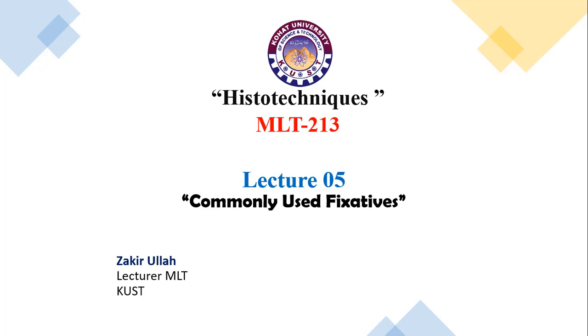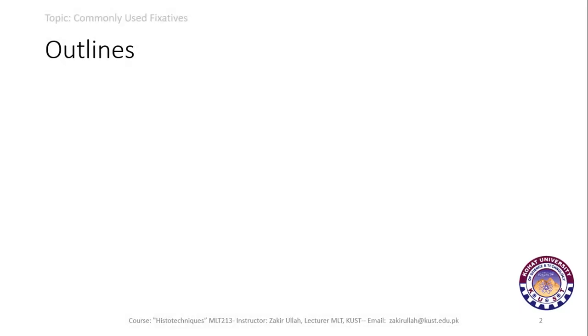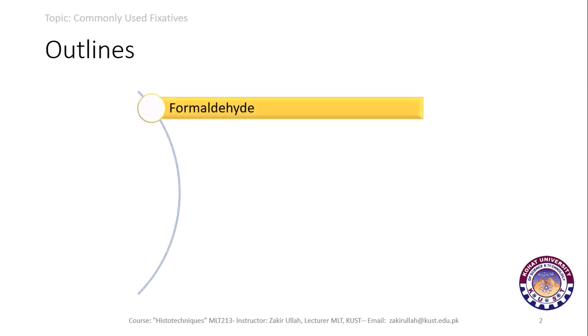Today we will discuss the different types of commonly used fixatives in the histopathology laboratory for the process of tissue fixation. The outline of today's lecture is the different types of fixatives.